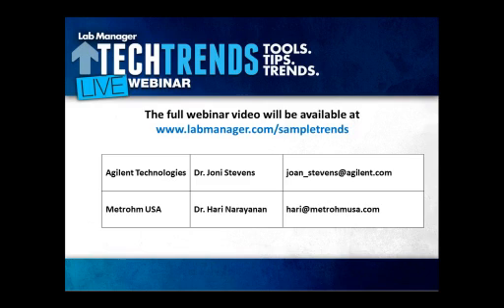Okay. And also, is GPC the right choice if they have to run several samples at the same time? Well, with the GPC column, sure, you can run one right after another. I think that's what they're referring to. You can collect your fractions, and if that person wants to email me, I will actually get them directly linked up with our GPC group.